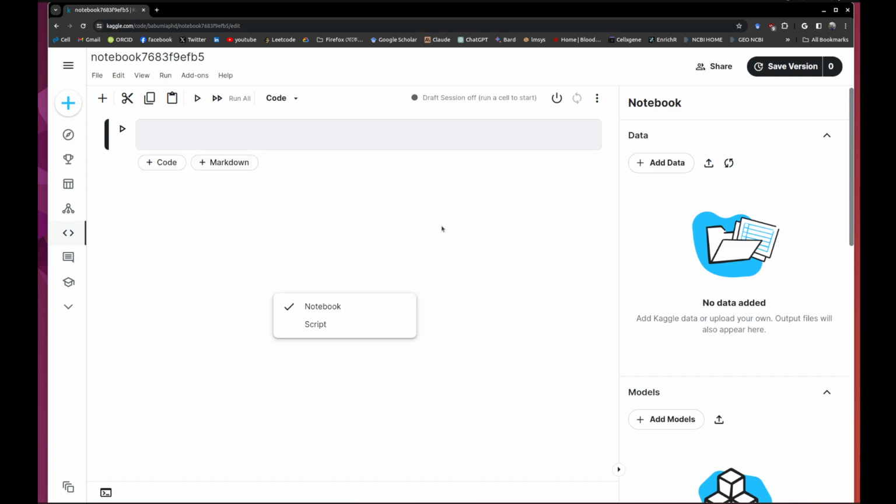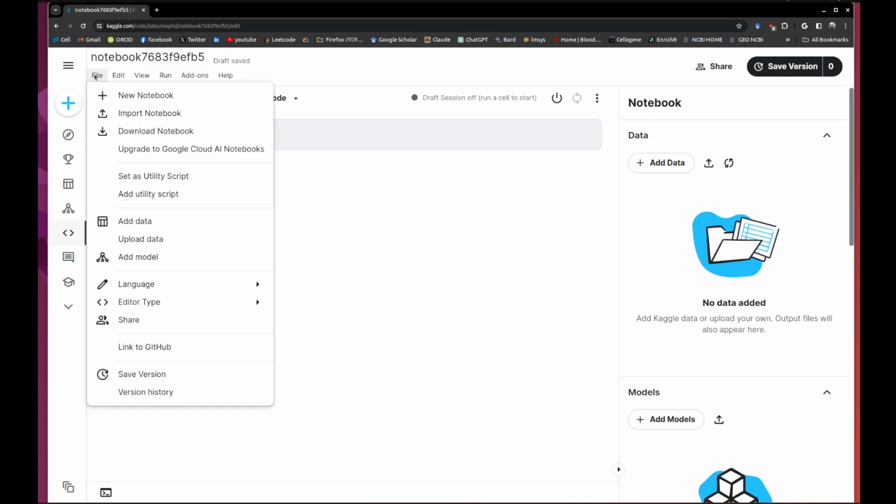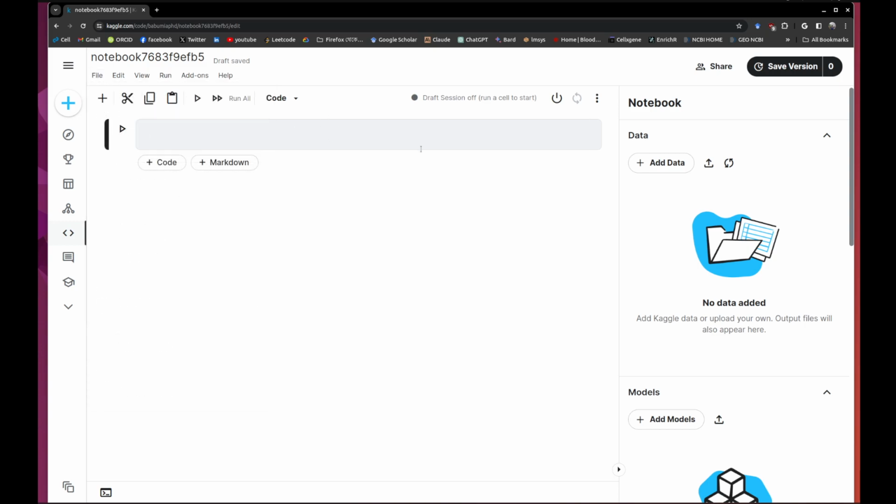So now let's see. We want to show a model, and we want to run an effective, for example, Python based notebook.